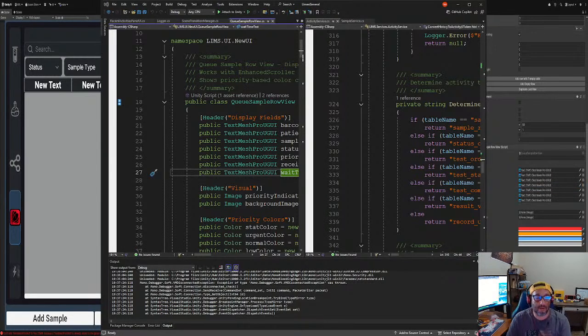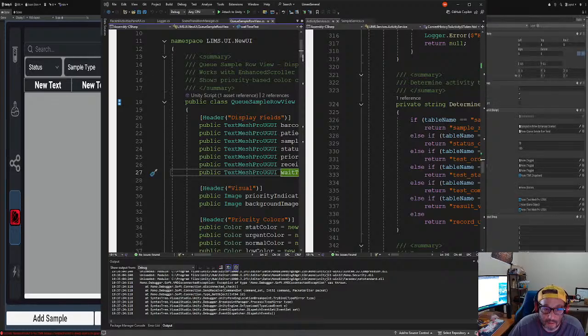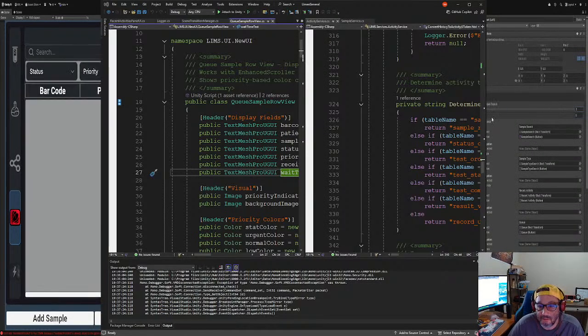All right. And so now we could go back and assign this Q. What was it? Q right here. All right, and assign this right here. And row height, I did 50. Max samples is 5. Whatever you want to do. Filters, you could just do all this later if you want. Okay, so let's start from the beginning and see what we got to fix. We're going to find bugs and all that.